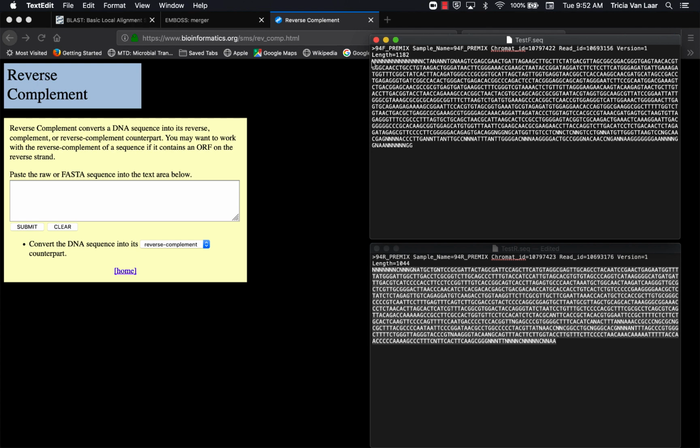We often see Ns near the beginning and near the end of a sequencing read as the polymerase is trying to get going and as the polymerase kind of peters out. So it's a different type of polymerase that we use for doing sequencing. So this is our forward read. We will also have a set generated from the reverse read, so reading from the opposite strand in the other direction.